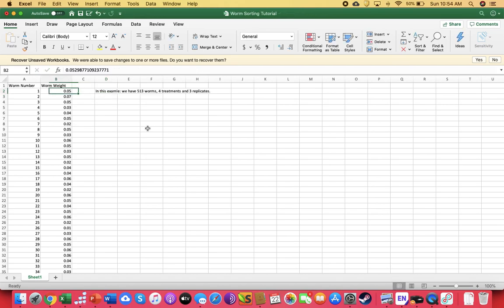And you've already got a situation where you guys have weighed 513 worms. You have them sitting in petri dishes on the table. They've got the number with a Sharpie on top of them. So worm number 1 weighs 0.05, worm number 2 weighs 0.07. And your job now is to make sure that each tank, and you've got 12 tanks, right? Because you've got 4 treatments, 3 replicates. Each tank gets the same number of worms and the same biomass of worms. So a total of 4 grams in each, with similar standards.